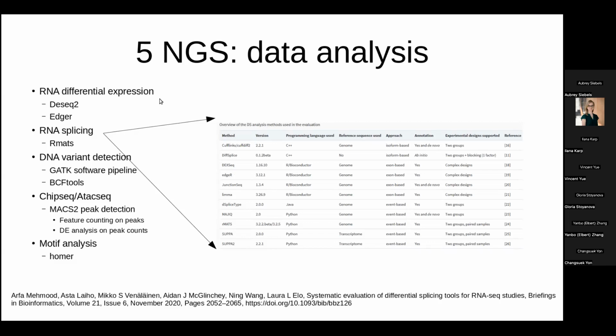Whatever you want to do, there are probably hundreds of programs and applications out there that do specific analyses for the data that you're working with. For splicing, it's like 10 or 11. This is just an example, and what we're doing here today is going over one specific package, DESeq2, to do a differential expression analysis, and also we're going to use DESeq2 to do an ATACseq analysis.